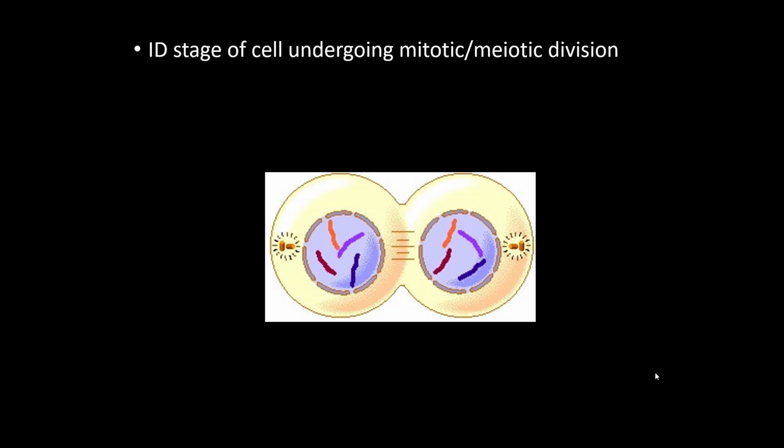All right, here's a different phase. We see that they have now divided and we're going through cytokinesis. The nucleus is reappearing, so this is telophase. In this particular case, this is telophase of mitosis.